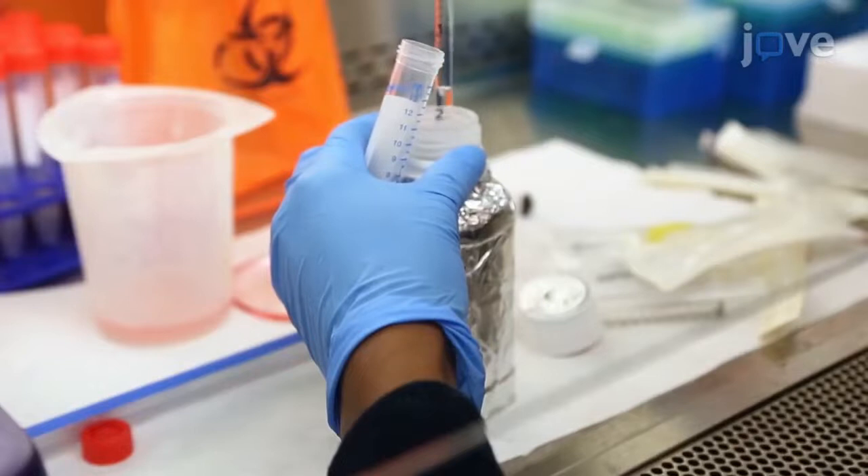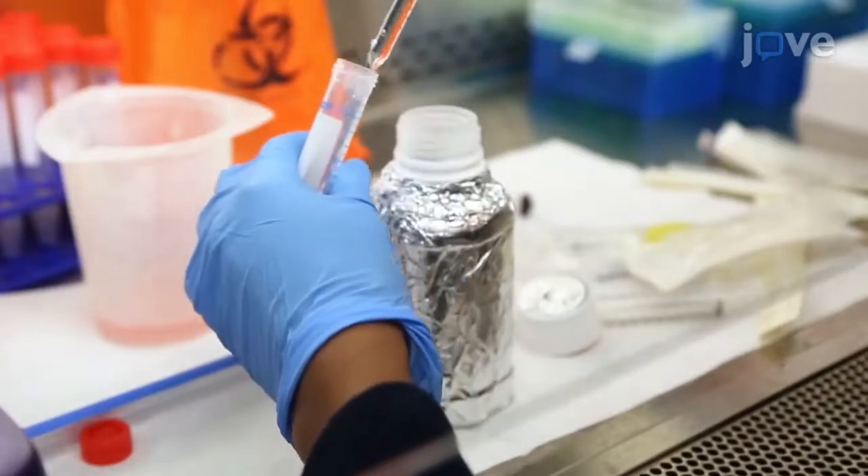Next, set out three 15 milliliter conical tubes for each tissue. Add 3 milliliters of density gradient medium to each tube and slowly overlay 4 milliliters of cell suspension for each tissue.